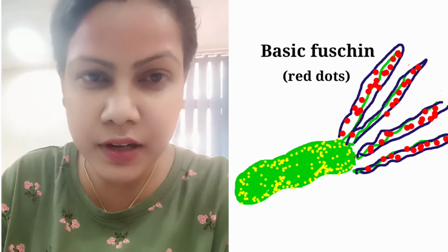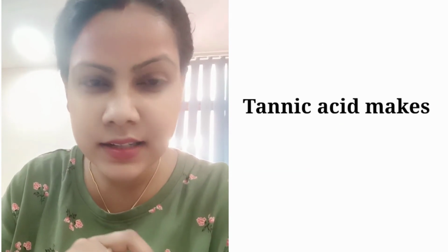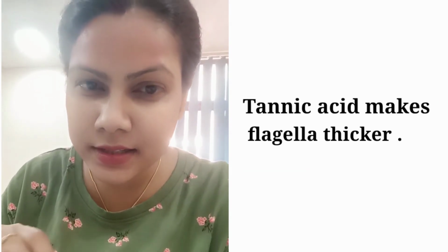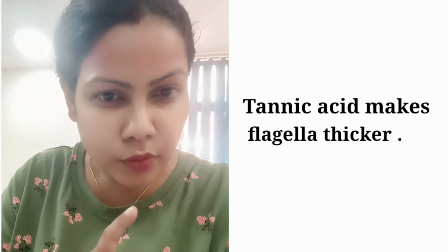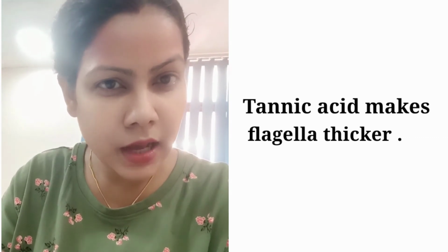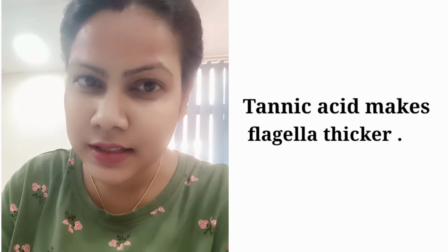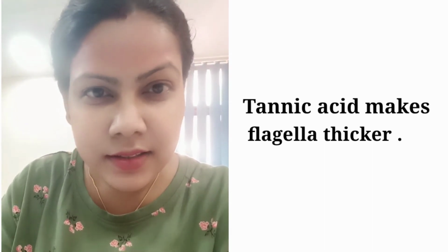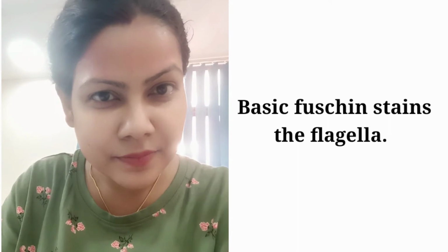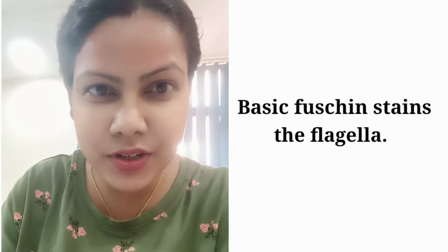Now, what is the effect of attachment of tannic acid? After attaching to the flagella, tannic acid makes the flagellar structure more prominent or thick. After becoming thick, flagella will be easily visible, and basic fuchsin stains the flagella, which is why we get a red colored structure.